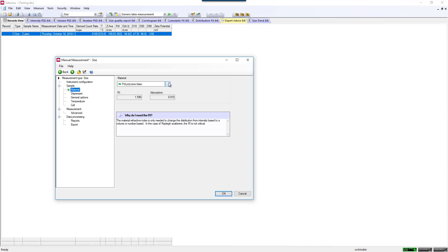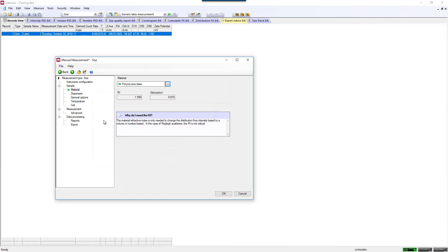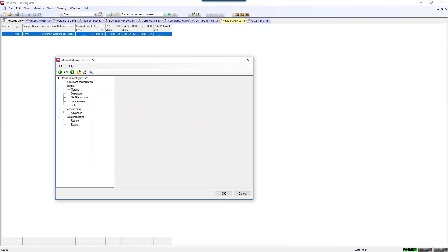There's a small library in the software where you can select from, or you can add your own to that library. These are all parameters that you can edit later, if you have made a mistake.